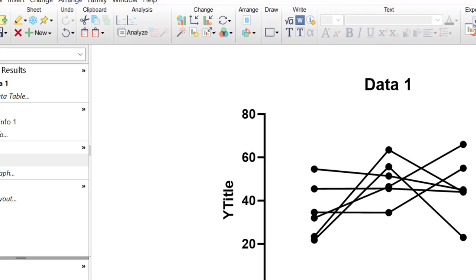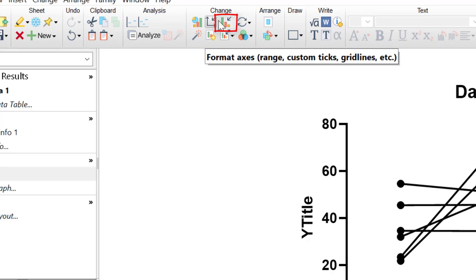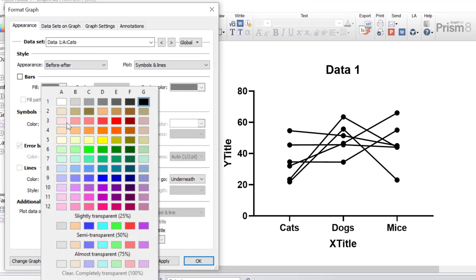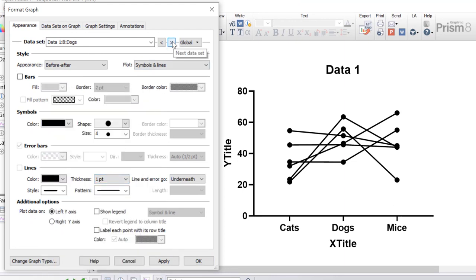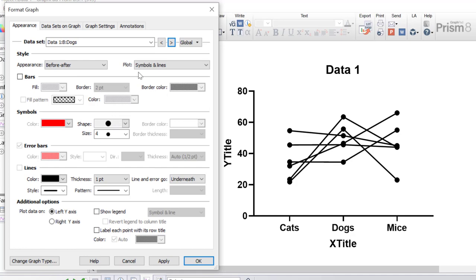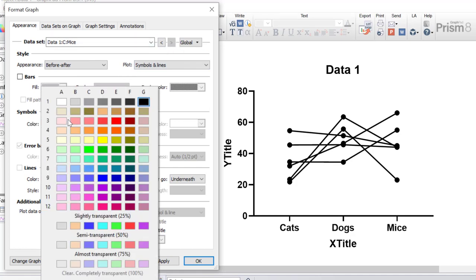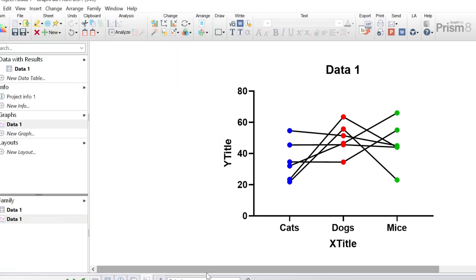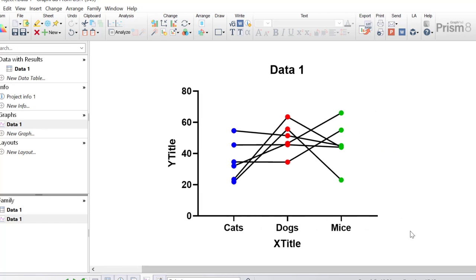The first thing I want to do is change the symbol colors to a specific color for each group. I'm going to go to the format graph button at the top and with the cats group selected I'm going to change the symbol color from black to blue, then toggle to dogs and change it to red, and then change mice to green. So now we have different colors attached to each group's data.